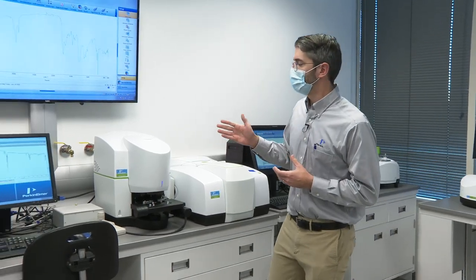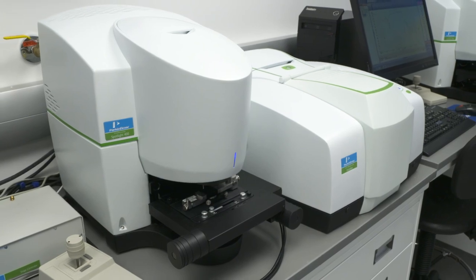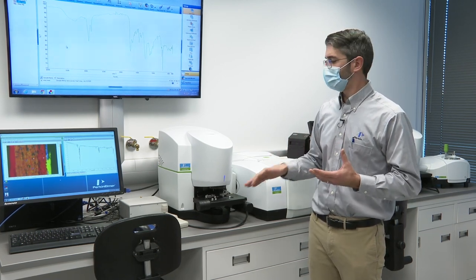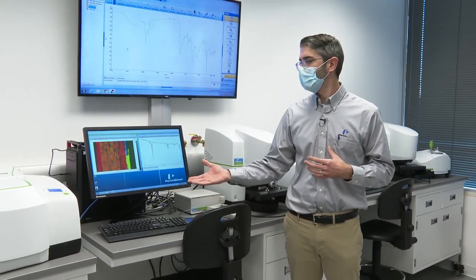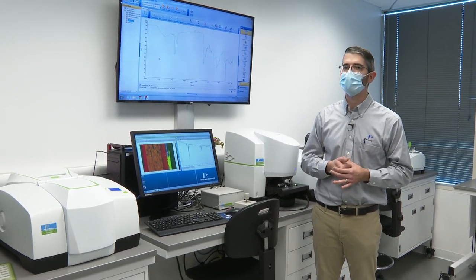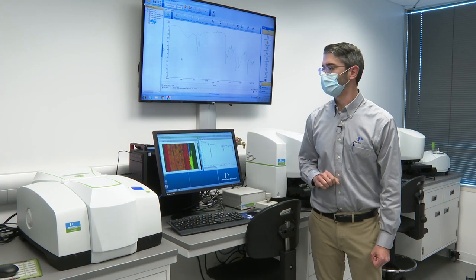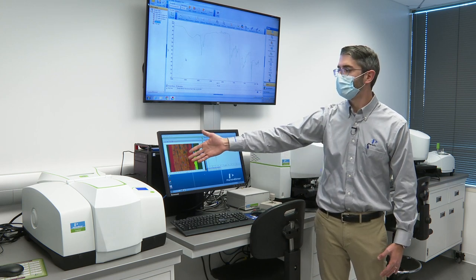The Spotlight 400 employs what we call the PerkinElmer duet detector. This system has two detectors: a linear array detector as well as a single point detector similar to the Spotlight 200. That array detector allows users to actually image the sample chemistry, so for each stage position on their sample they get 16 spectra from the system. In this example we're looking at a cross-sectional analysis of a multi-layer package used to house coffee in a single-serve pack. The infrared image with the ATR imaging accessory shows that this package is quite complex — multiple layers comprised of multiple different polymeric materials, each critically important to the performance of the finished package.